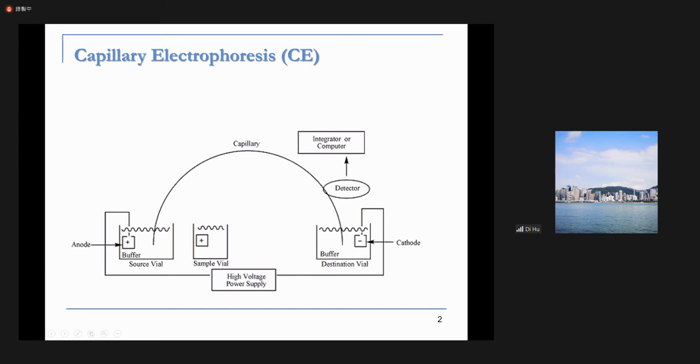For capillary electrophoresis, we already mentioned that it's a relatively new technique, often used for high efficiency separation of sample ions. We say high efficiency; later on you will see that when we compare the N number with normal HPLC. It is kind of an LC technique, but a new version, a next level.